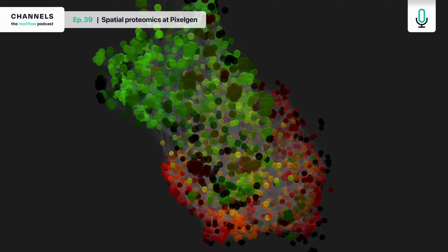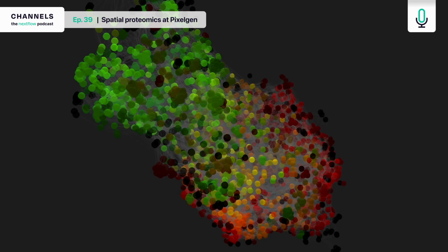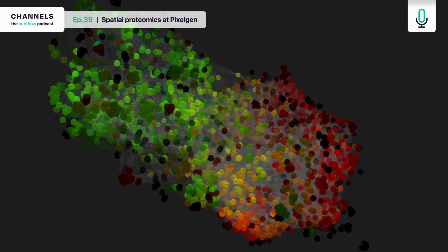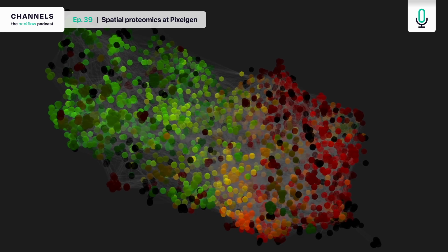So, I mean, that's taking an accident and making it a virtue. You're a former 10x employee. I remember working with 10x single cell, and whenever you have doublets, it'd be a bit of a problem, because you can't really do much with that data. But here you're making it into a good thing.